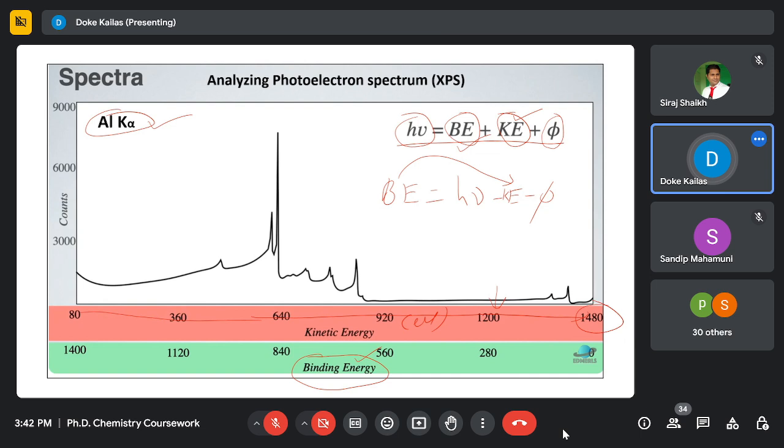There are two peaks. One has less intensity, and the other has more intensity. Such lines of different intensity are observed in IR spectra, FTIR spectra, Raman spectra, NMR spectra, or ESR spectra. Likewise, in UV or visible spectra, we can observe this on the photoelectron spectrum.